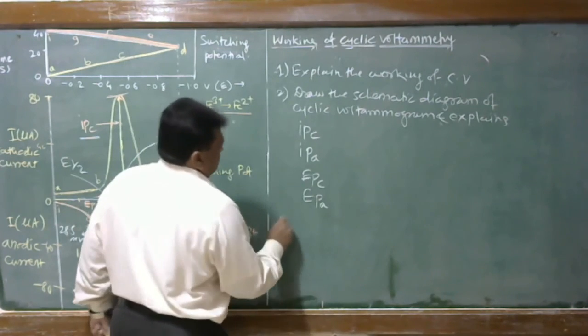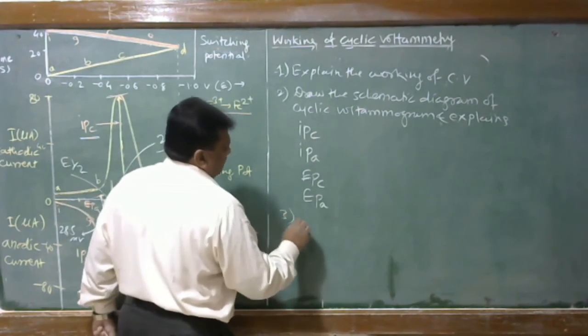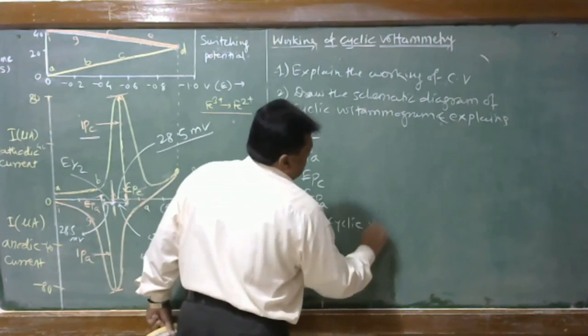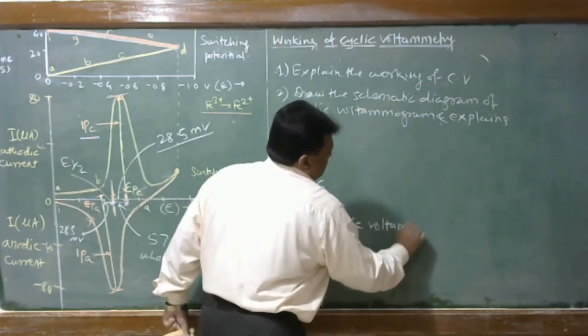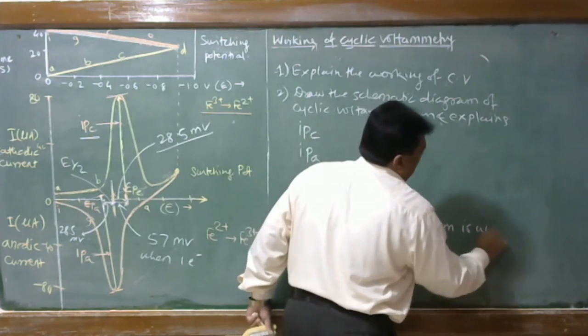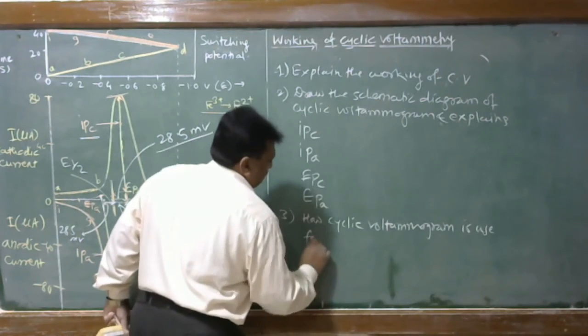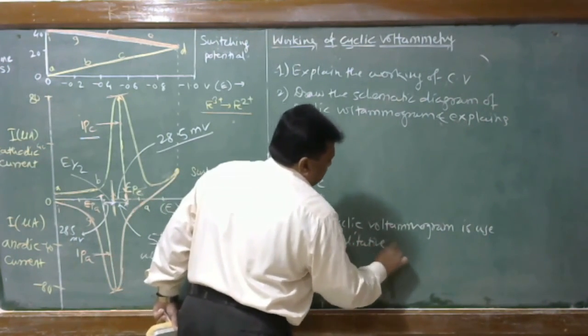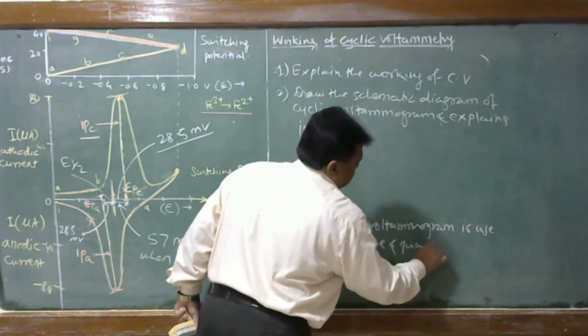In addition to this, you can write out the answers how cyclic voltammetry or cyclic voltammogram is used for qualitative and quantitative analysis.